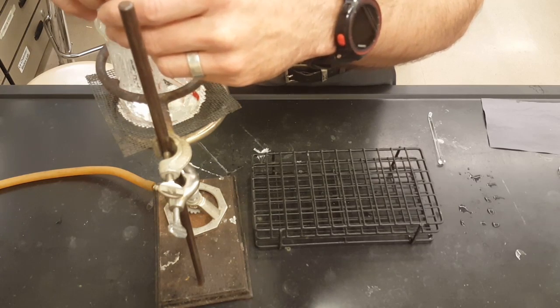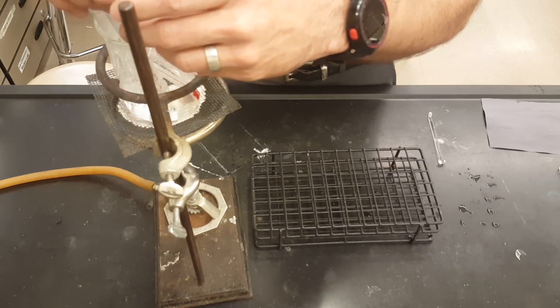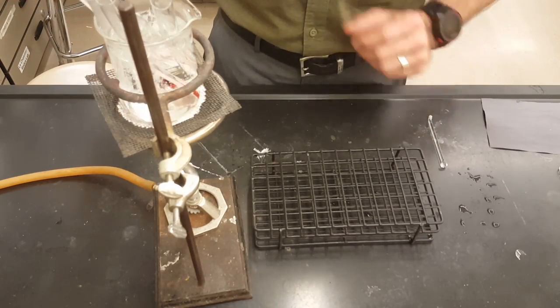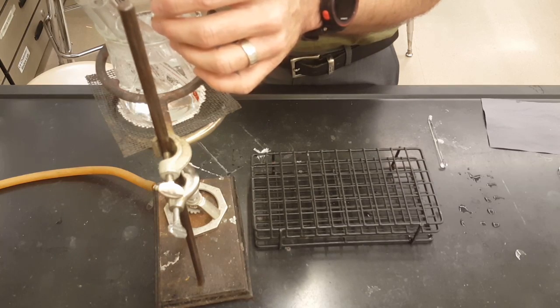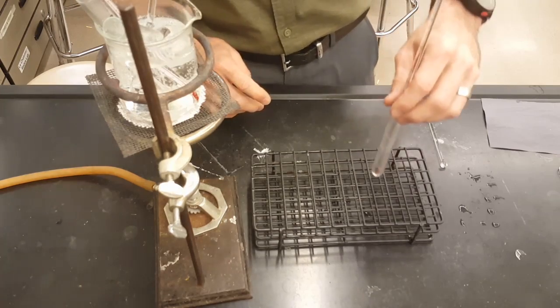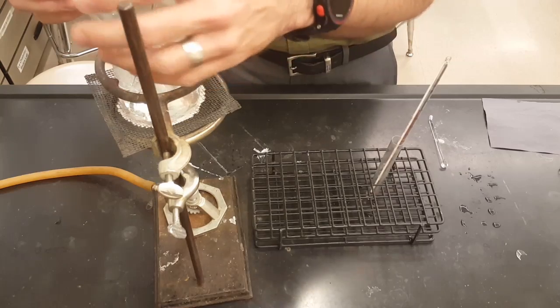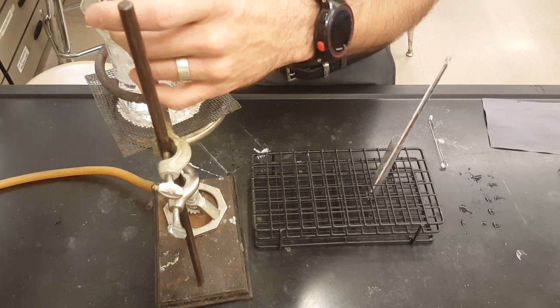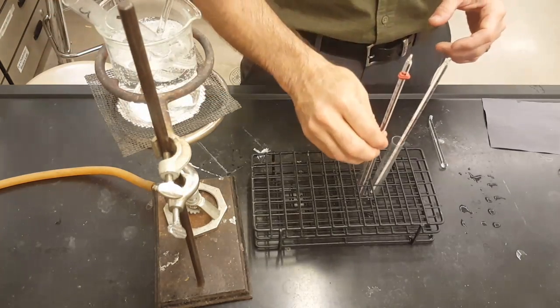The 8 grams per 5 milliliters of potassium nitrate is going to crystallize the fastest. So you'll take your pre-warmed and clean thermometer, place it into the 4th test tube, or test tube 8 grams, and pull it out and set it in your rack. Then you can take your 2nd thermometer, find test tube 3 or the 6 gram test tube. Make sure your thermometer's clean. Place it into the solution and put it in your rack.